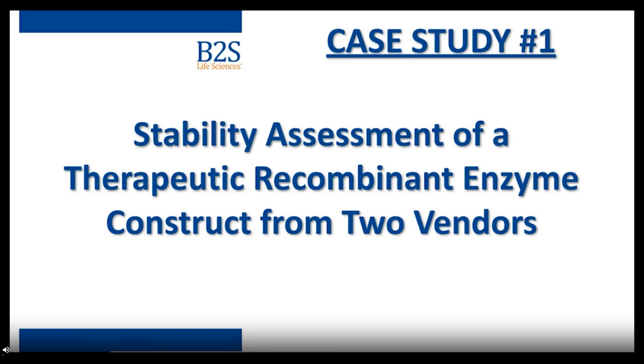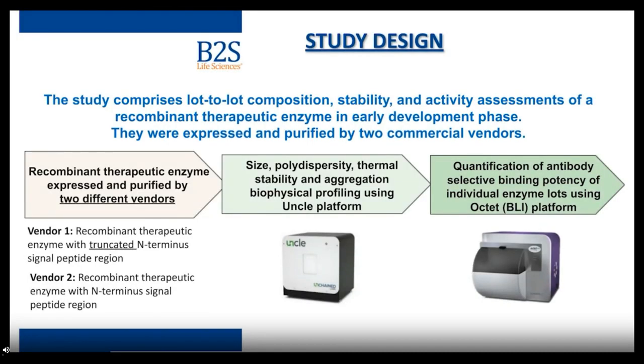So we chose our advanced characterization methods accordingly and gathered data to make our conclusions. So on this slide, I present the study design for this case study. We were seeking to learn 3 key things about the enzymes: what composition, stability, and activity were.